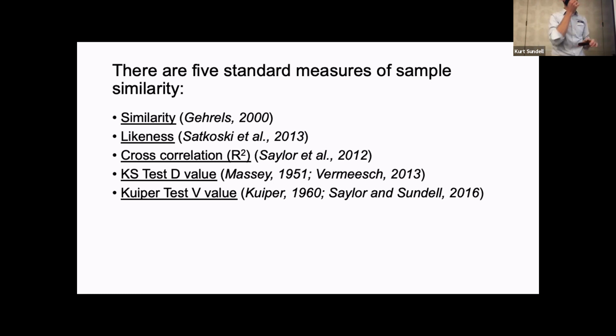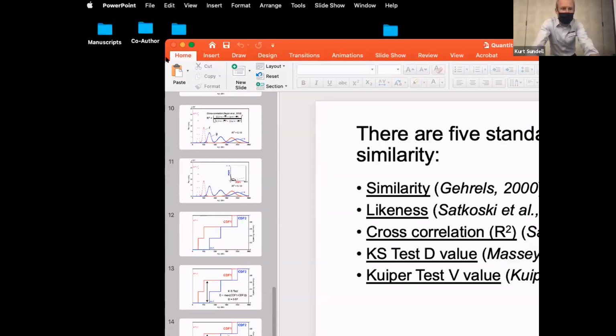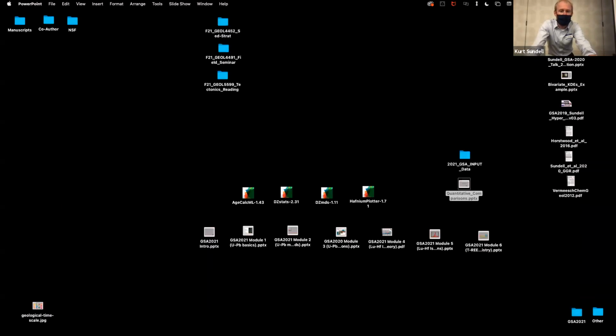And we're going to talk about that in this next part when we start using the DZ stats program. And a slideshow. Okay, so yeah, this will be on the drive, and like data reduction, I am happy to stay here all night and talk about it after the short course. But for now, let's dive into the DZ stats.